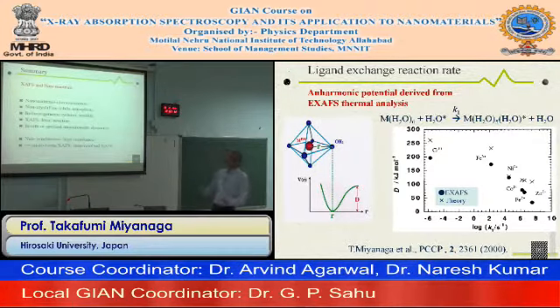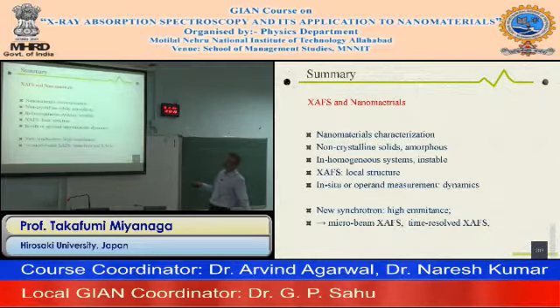EXAFS and nanomaterials. EXAFS has many merits for nanomaterials characterization. For non-crystalline, solid, amorphous, inhomogeneous, and unstable materials, EXAFS shows a very strong point.